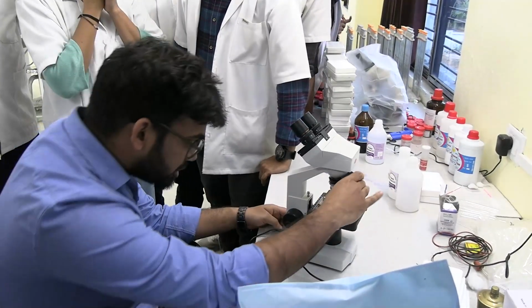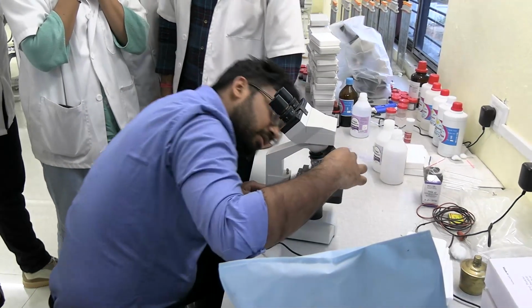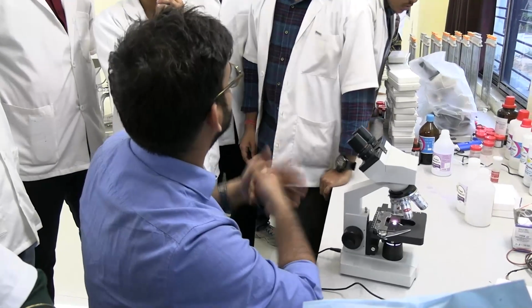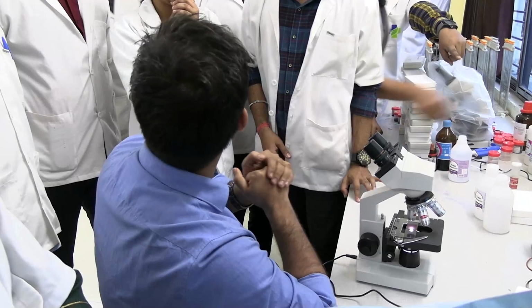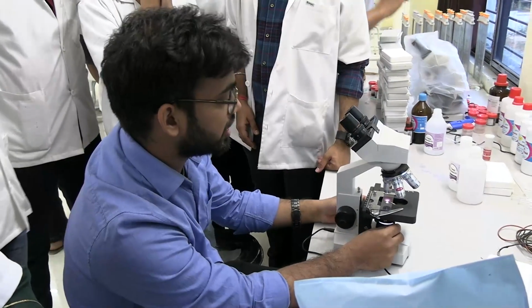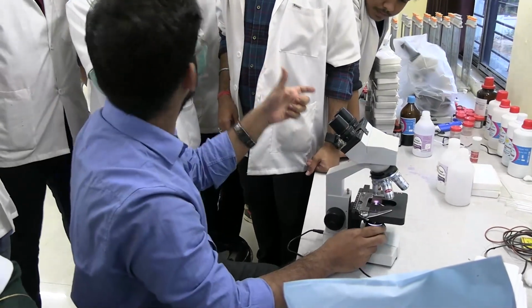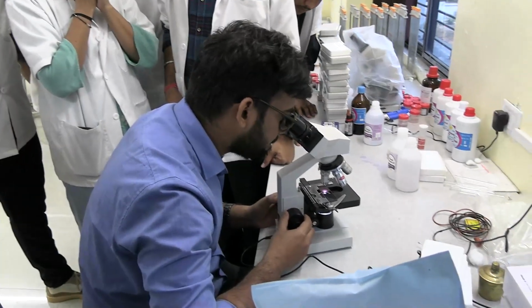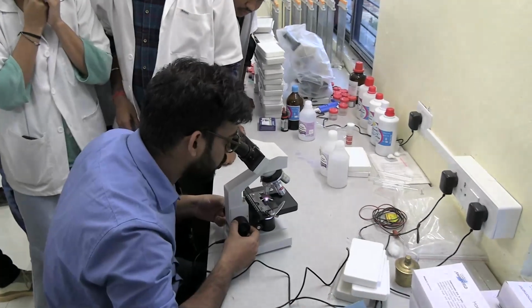Suppose this is our oil immersion. Suppose in 10x, what will be the position of your condenser? Lowermost part, middle part, or uppermost part? In 10x, the condenser should be at the lower part, and the diaphragm should be slightly open. Now I am going to focus it. What adjustment is this that I am doing? Coarse adjustment.